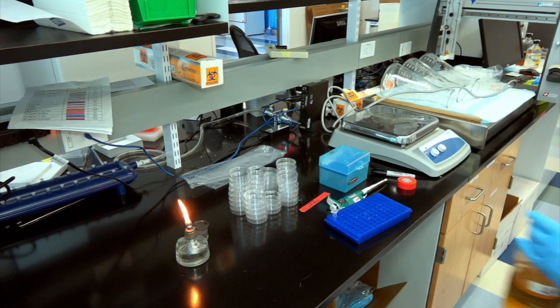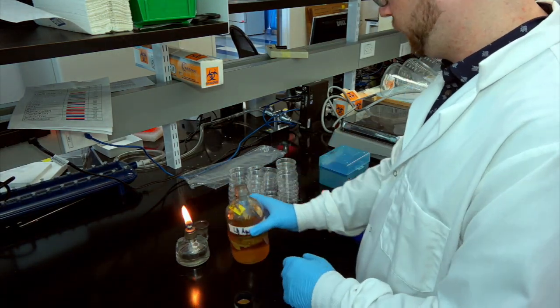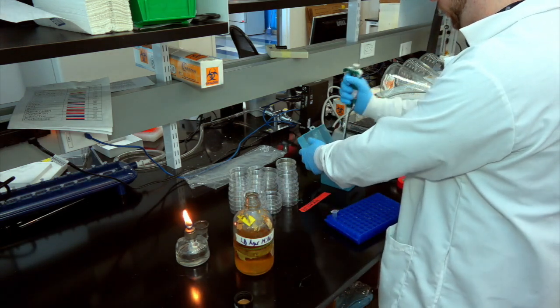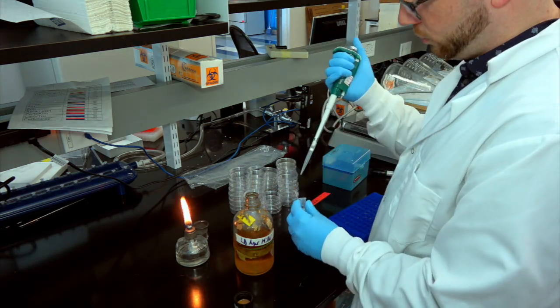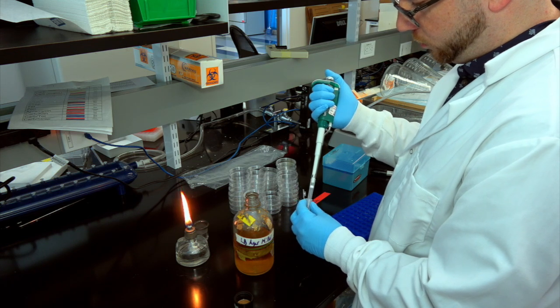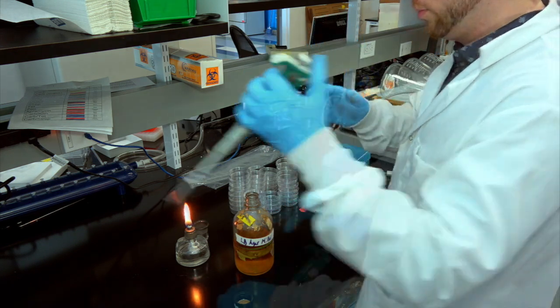To begin the plate pouring process, we light the flame at our gel pouring station and dilute our antibiotic into the 60 degrees Celsius agar mix. We're adding 220 microliters because we're diluting our antibiotic 1 to 1000 into 220 milliliters of agar. Once the antibiotic is added, it's time to start pouring our plates.